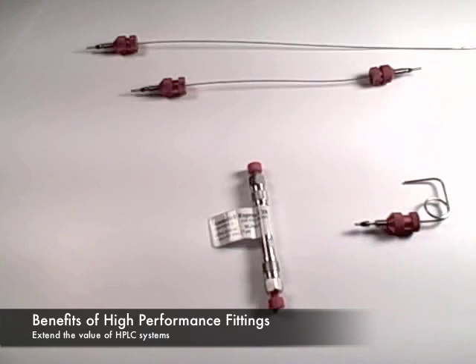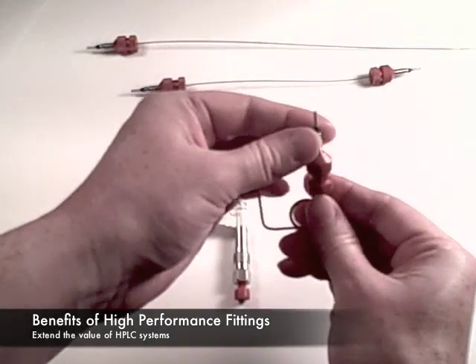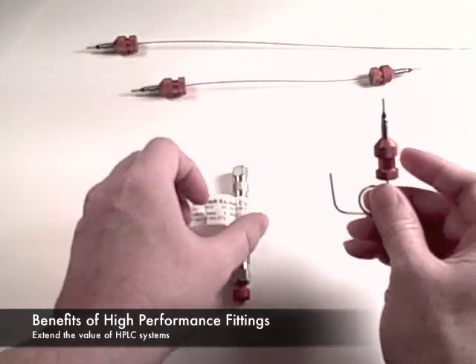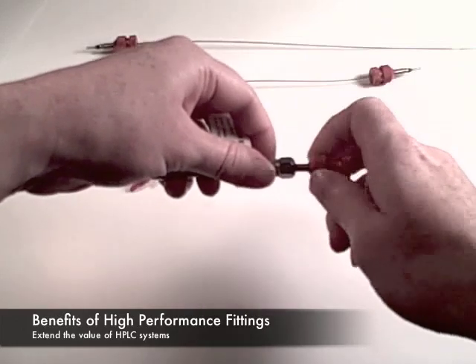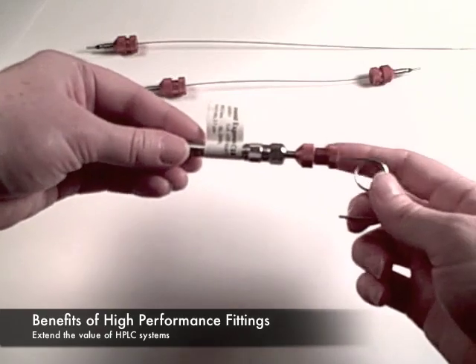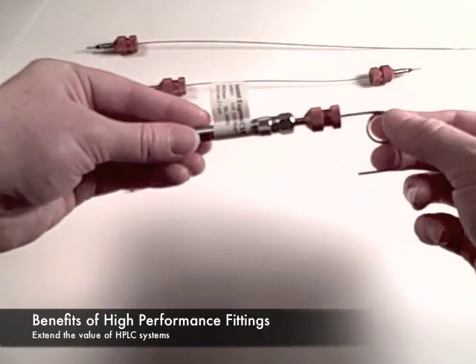To install the fitting on a column or instrument, start with the tip extended and the cap almost completely removed. Insert the tip fully into the port and finger tighten using the grip ring. Lightly snug the cap. It's as simple as that.